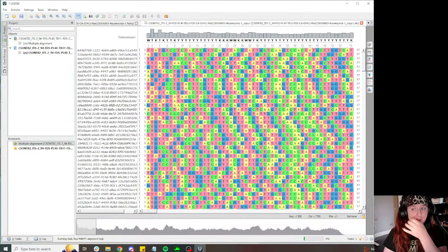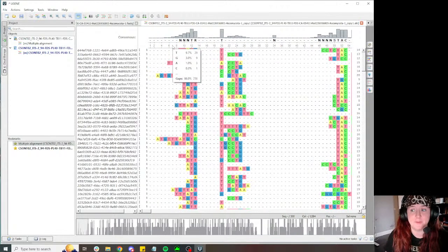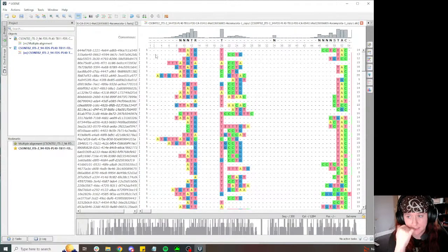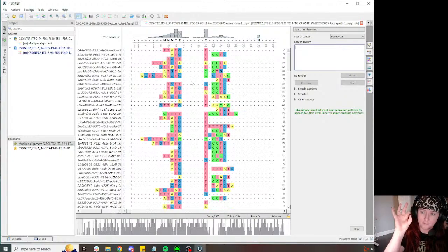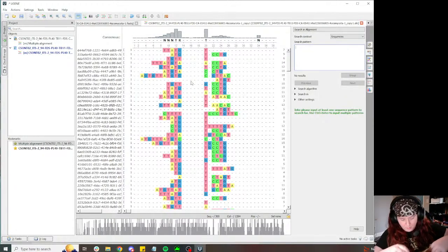it is very cool. Yeah, that's how it was described to me. Basically there's a little tag primer that's attached to the beginning and the end, and it uses that to read it. Yeah, it's crazy. Once you've done all the processing, there's this tiny little drop of liquid that they'll put in the nanopore.